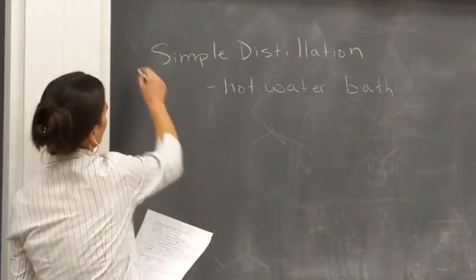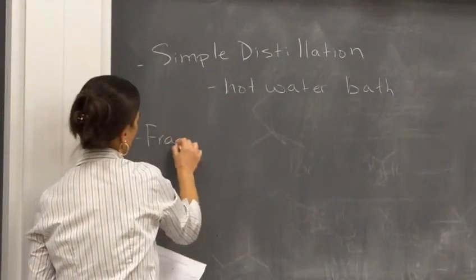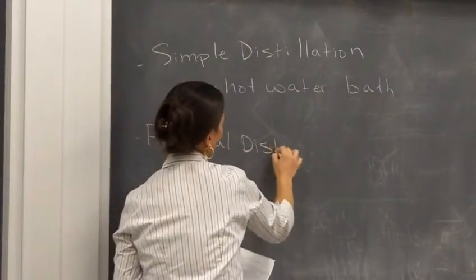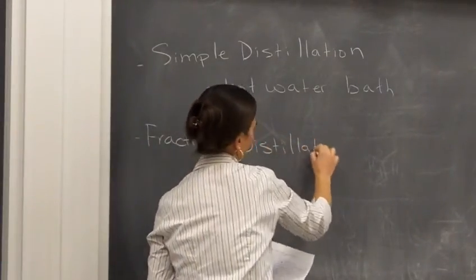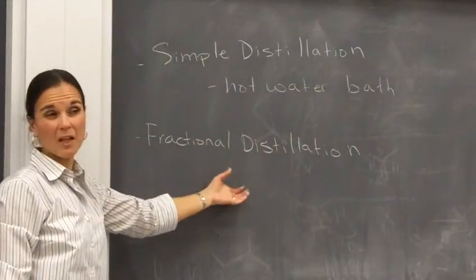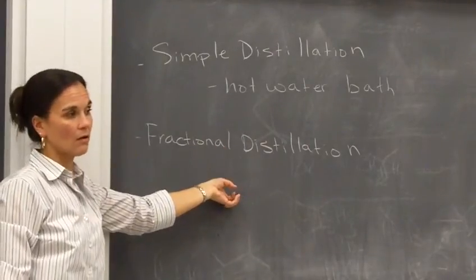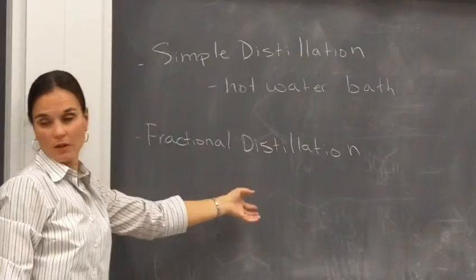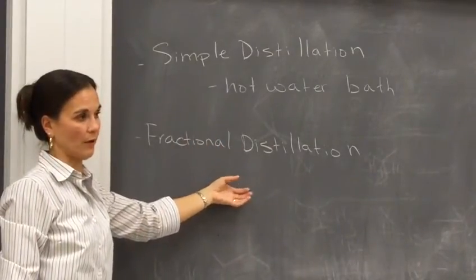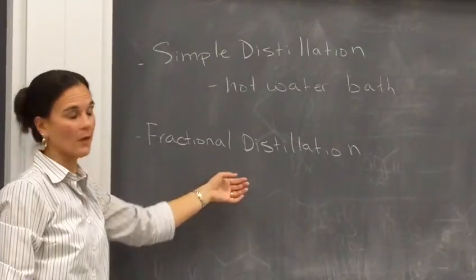So first part is a simple distillation. Then your lab manual talks about a fractional distillation. This is where we're going to use our all-in-one simple distillation apparatus, and we're going to collect anything that boils below the boiling point of our alcohol as impurities, and then we'll collect our alcohol at its given boiling point, or you're going to start about 20 degrees below its boiling point, okay?